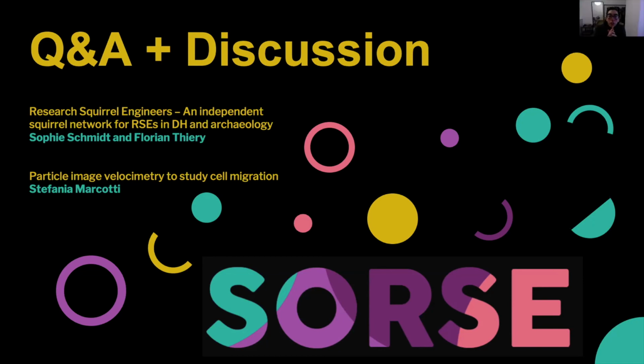That's a very good question, and something I've never seen despite trying to run PIV on almost everything that passes through the lab. So I never had the case of different motions across the movie, but I can't see why that couldn't happen. The code is not optimized to change a parameter halfway through, so you would need to divide the movie into 2 parts and run the PIV twice on the 2 separate chunks of the movie.